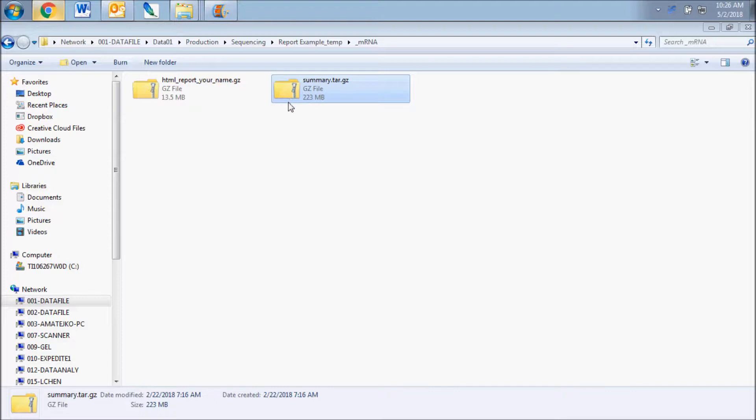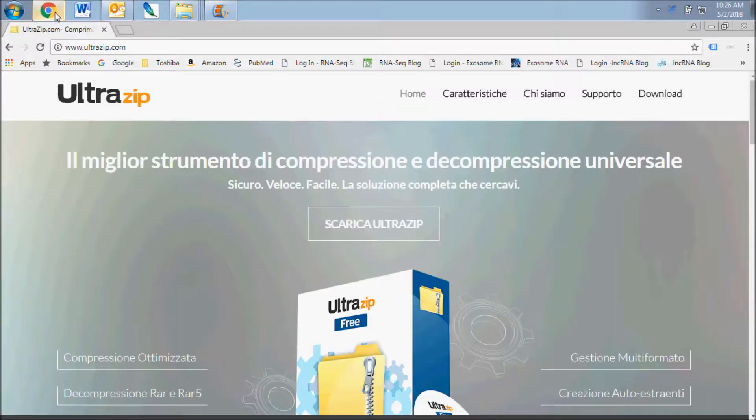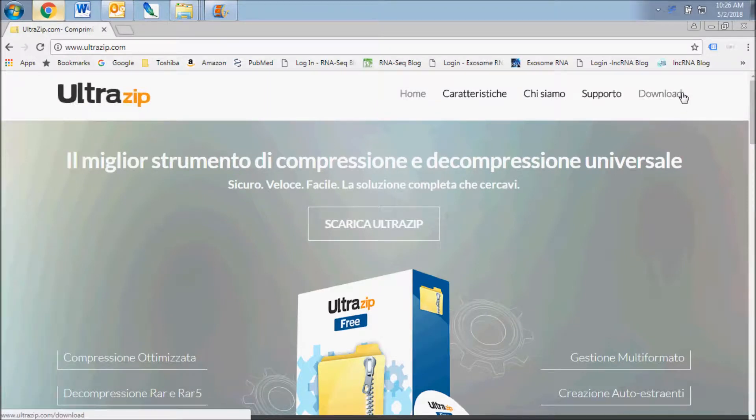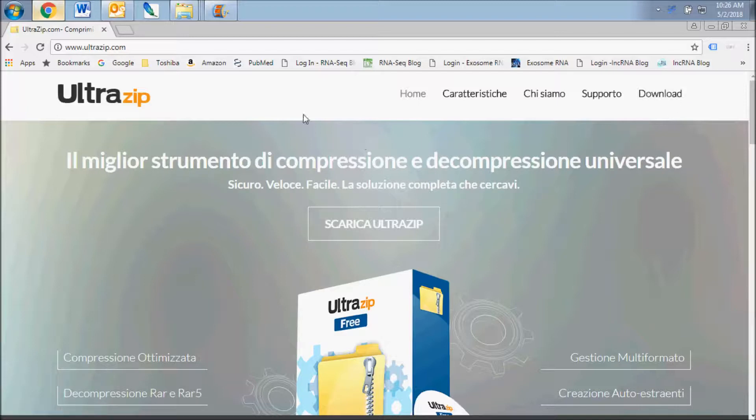These are GZ file type which can be opened with a number of file compression programs. If you have any trouble unzipping the compressed archive files, we suggest a free program called UltraZip.